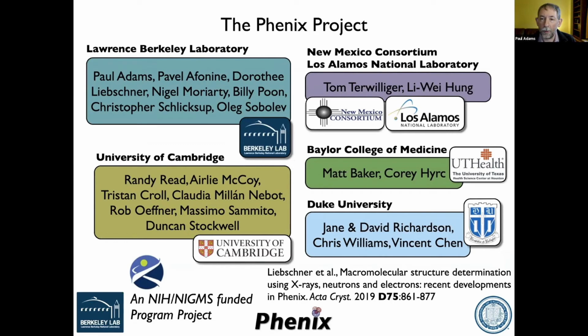Yes, so I think, once again, you shouldn't confuse it with refinement. Refinement is one thing; it doesn't need to know exactly form factors and such. But when it comes to calculating a map, you need to specify correct form factors, and Phenix.F model is the tool to do this.